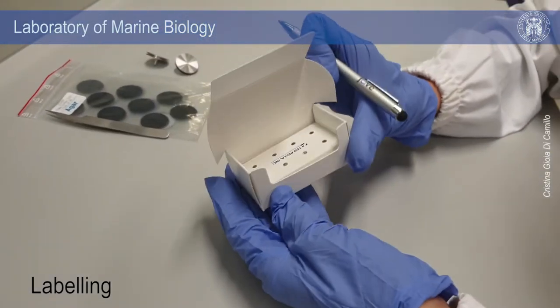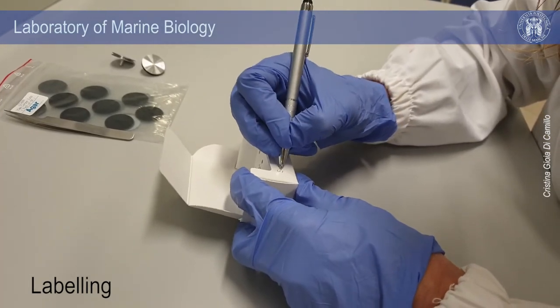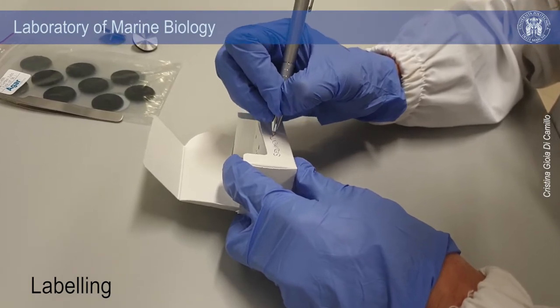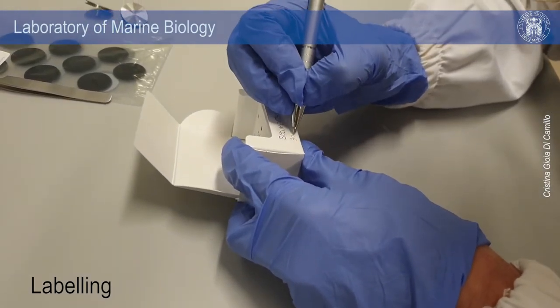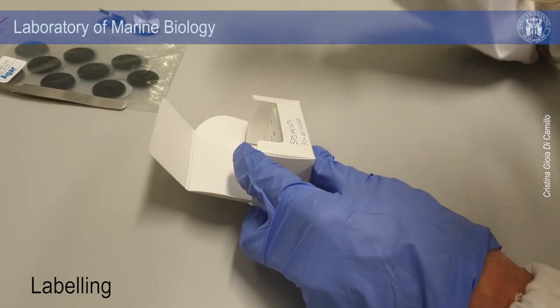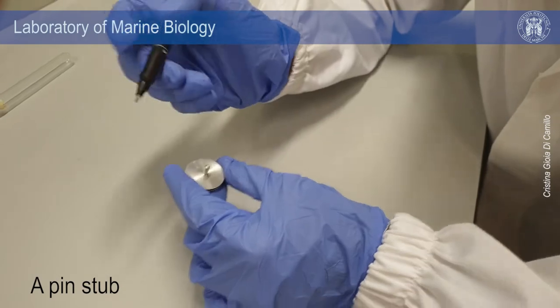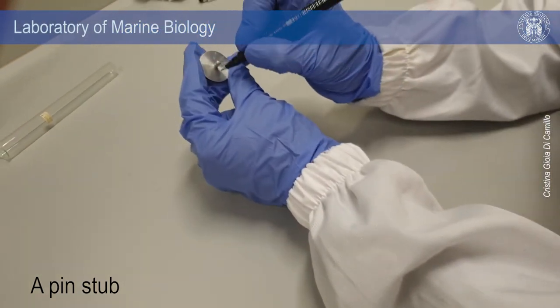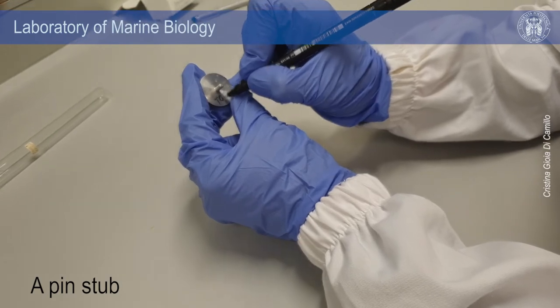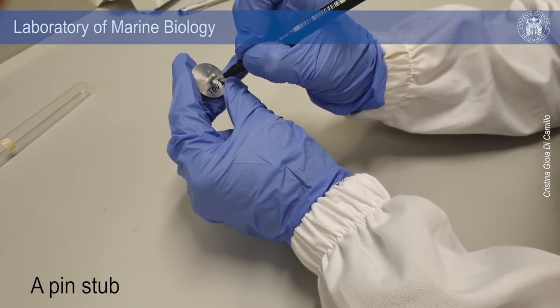After the CPD, prepare a box for containing your samples. Remember to properly label your sample box. Now it is necessary to place the sample on pin stubs. A stub is a small dish made of aluminium measuring from 8 to 12.5 millimeters. Add a label to the stubs with a permanent marker.